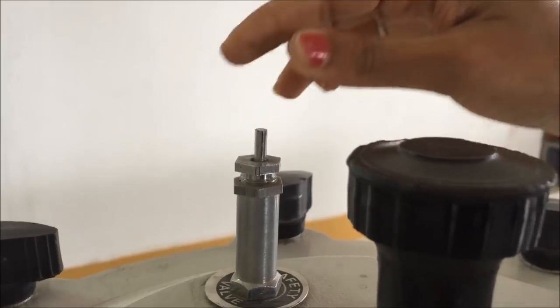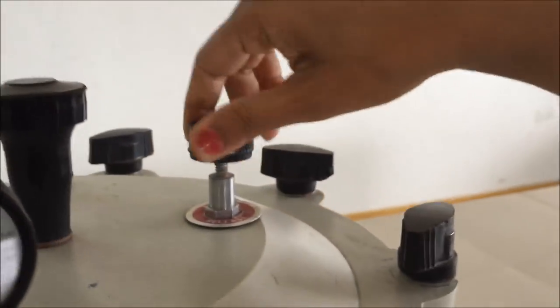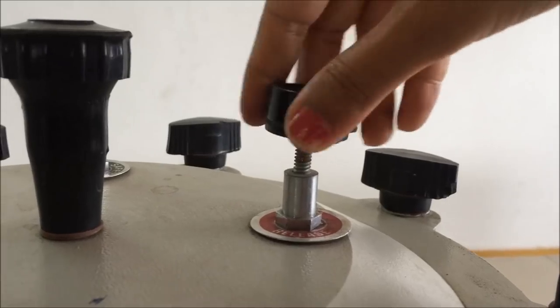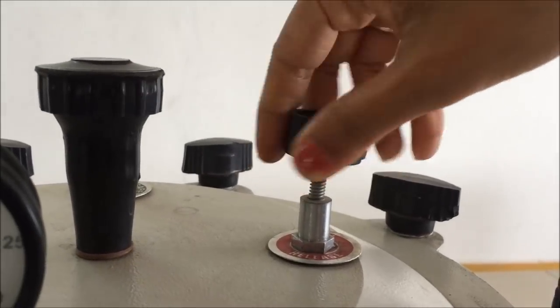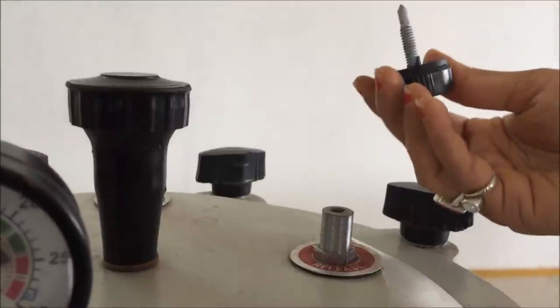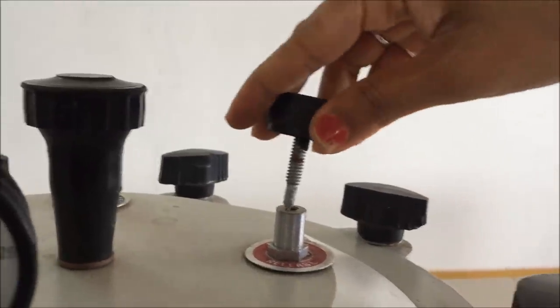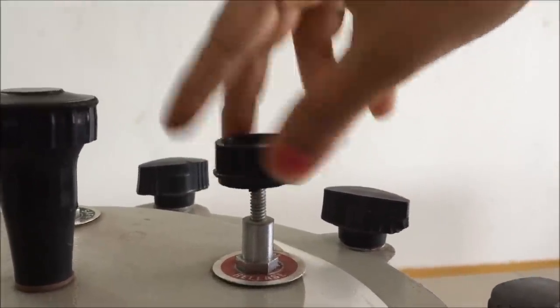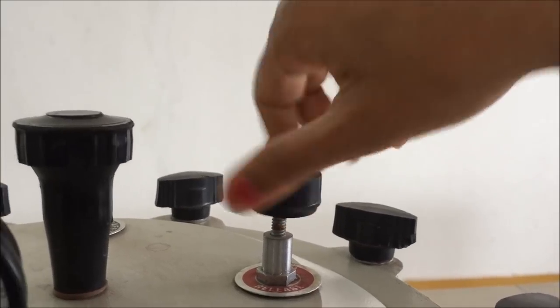It releases the pressure by destructing the rubber valve in between them. This is a simple screw nut which can release to remove the vapor from autoclave and it can be re-tied by rotating it to the right hand side.